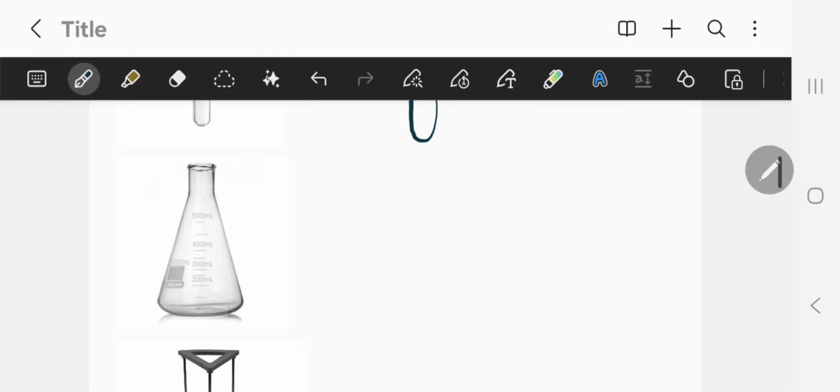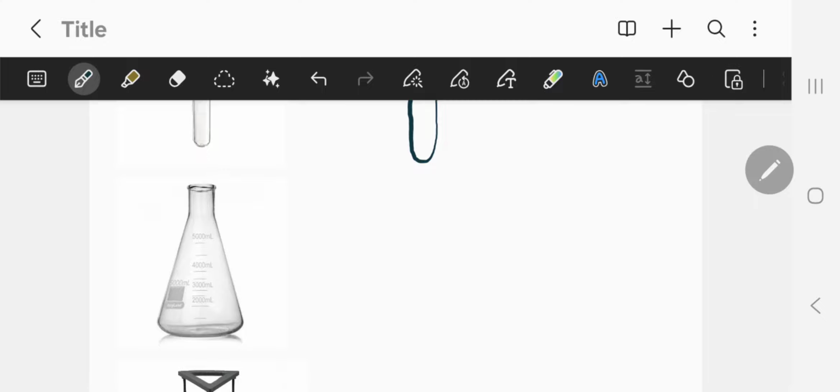Next, this is called a conical flask. Okay, this thing's used for mixing, heating, and even storing liquids. Okay, they're very stable. They're better than things like beakers and test tubes because they've got a wide base here, okay, and a narrow neck, so they can trap liquids to reduce any spills or accidents. And the way you draw a conical flask, just by looking at it, it's got a spout on both ends. So there's one there and there's one there. Here's what I'll do. So like this, and then it comes back in. That's the neck of it. And then it comes out.